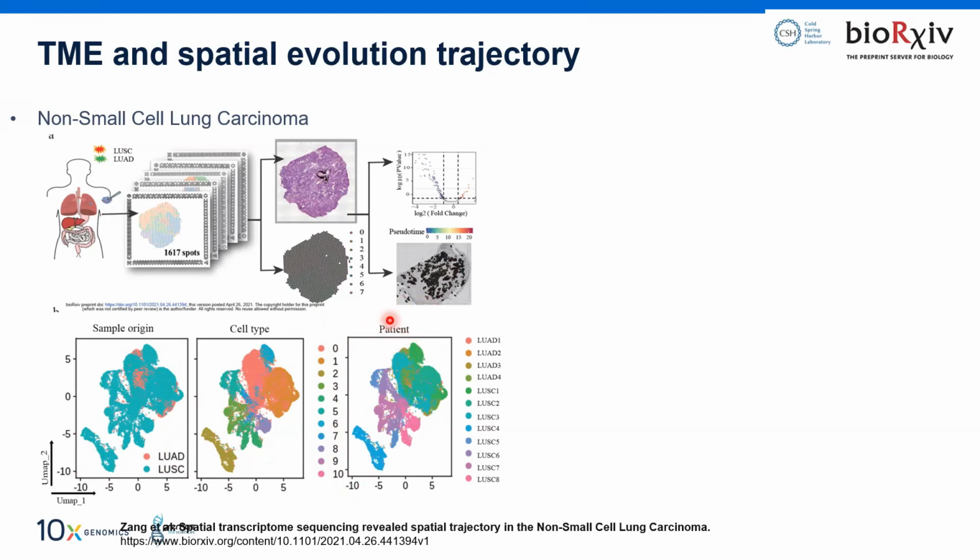The most important part is the patient-wise analysis. When you do the patient-wise cell population analysis, you are able to see this one, the fourth one. It has its own cell population, which is very different from the rest of the samples. So this means this patient has uniqueness in terms of the gene expression of the cell population.